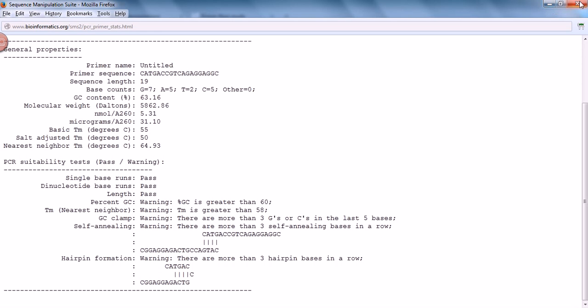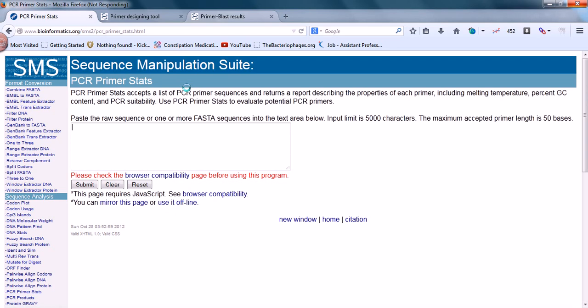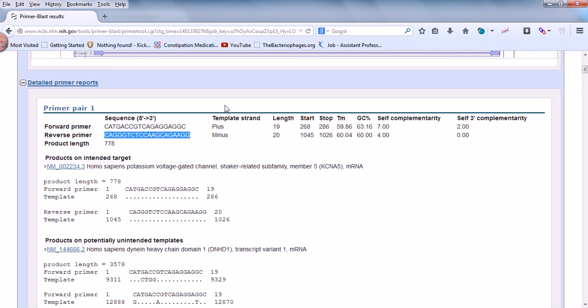3 out of 7 is not a good score, so we can discard this forward primer. Now let's select the reverse primer of this same pair. Let's go to the reverse primer. Here we go, this is the reverse primer of our choice, 20 nucleotides long. Let's copy it and put it here.